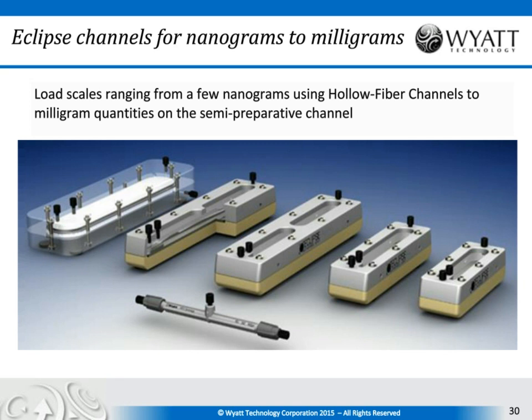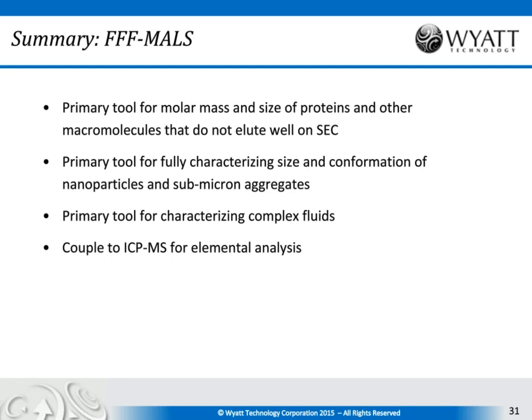To summarize, FFF-MALS is going to be your primary tool for molar mass and size analysis of proteins and other macromolecules that don't elute well on SEC, as well as for nanoparticles and submicron aggregates. In particular, if you have complex fluids, which combine both macromolecules and nanoparticles, it's probably the only way to get a proper separation and sizing. And in addition, you can even couple the FFF to ICP-MS if you need elemental analysis.